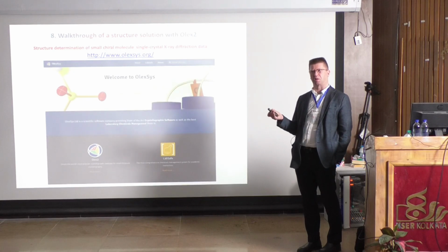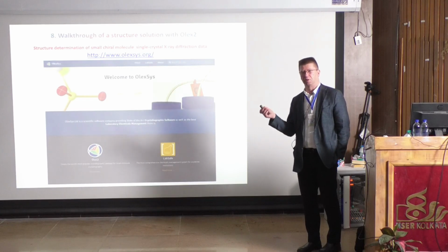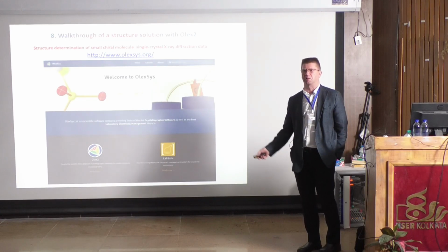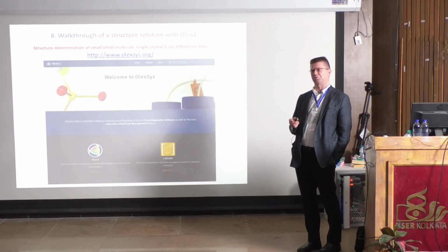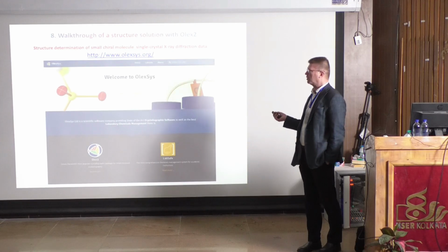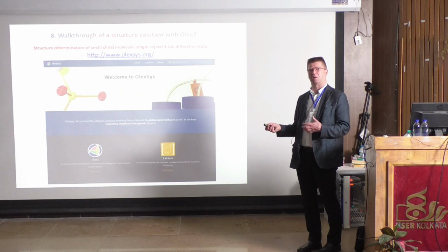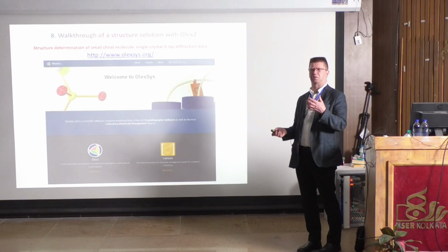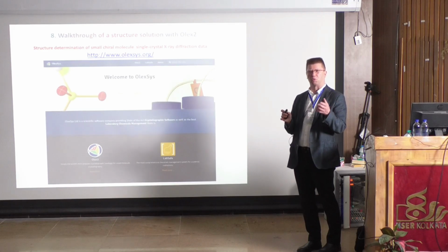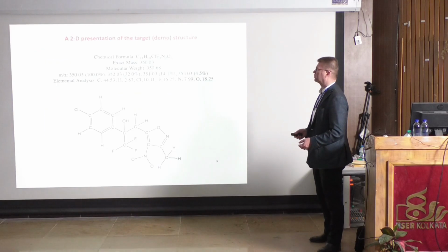Tomorrow is the analysis part, and then finally in the last lecture I will show you real examples over my career of 30 years or so, different kinds of supramolecular structures, what you can do with it. So this is, I would say, relatively simple work now. It's not very complex. And always in this course I'm using excellent data. So there is no disorder or anything of this kind, everything is as it should be. Of course, because you have to start from the good examples.